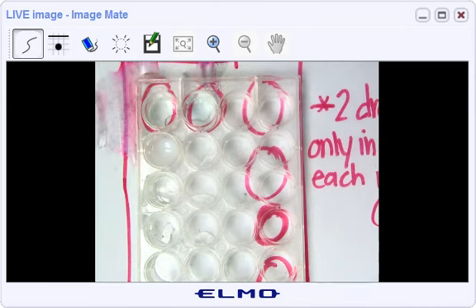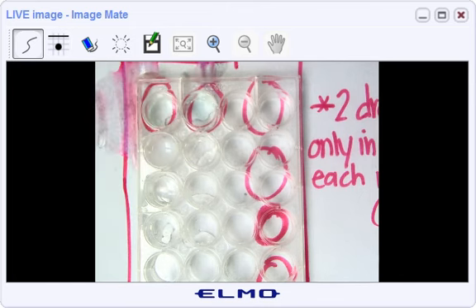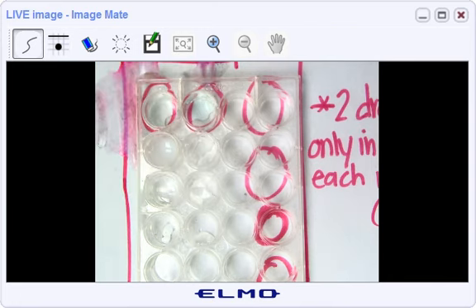And then after that, AgNO3. After that, KNO3. And I'm just going down the column boxes. And last but not least, CaNO3 too.